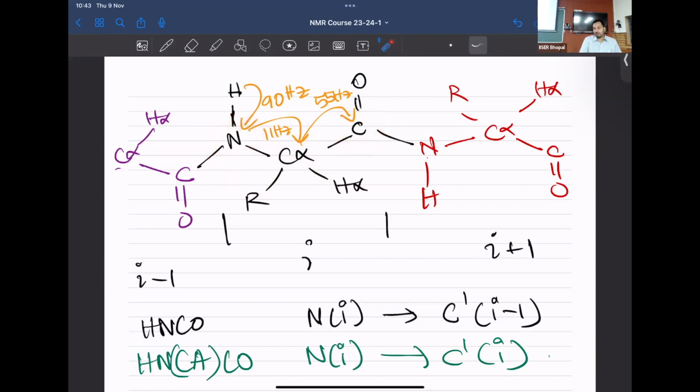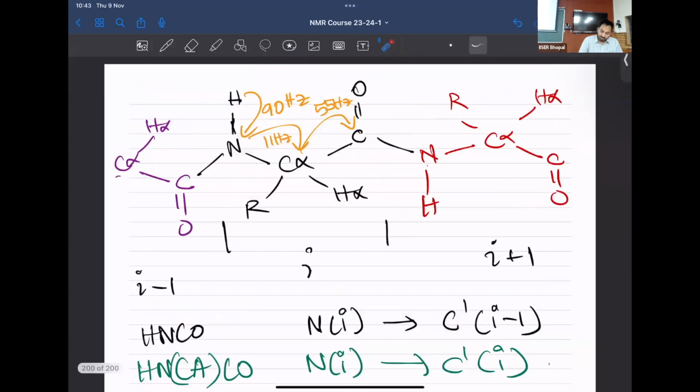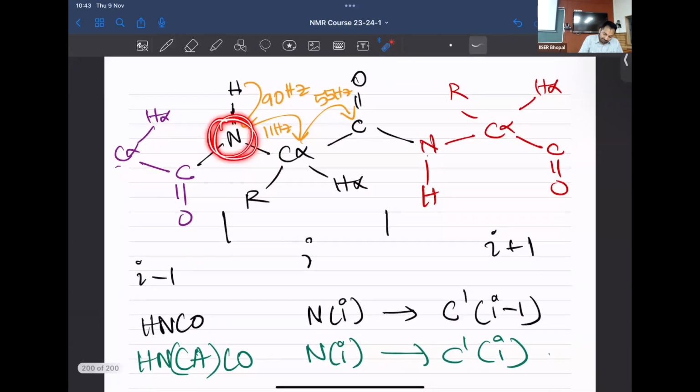Right? So now what is going to happen for every I, you're going to get the I plus 1, I minus 1, and I. And therefore, as much as you've gotten that for this one, you'll get the same thing for this one, isn't it? The same information will be applied for the next one. If you put all this together, can you stitch them together to get the entire assignment? At that moment, although you did not know which nitrogen belonged to what, you will now clearly be able to say which nitrogen belongs to who at that point of time.